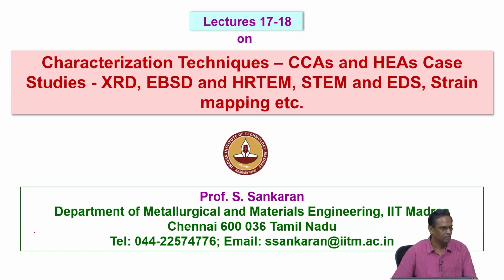then identifying short range order or long range order is difficult. Suppose you just think about the atomic scattering factor of all the elements, right? When we look at X-ray diffraction techniques, the structure factor is something we always calculate, right? So when you have multiple principal alloying elements, and you consider the scattering factor of all these elements, if they come very close, then there is a problem.